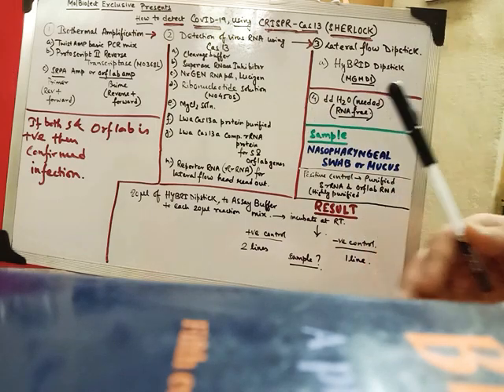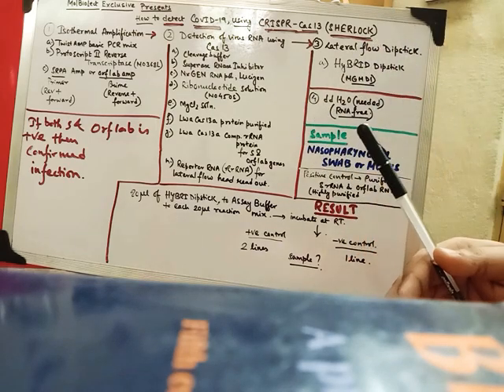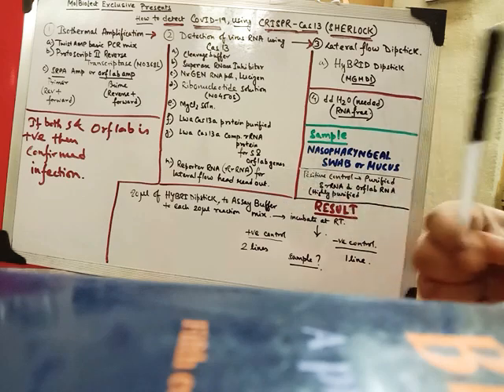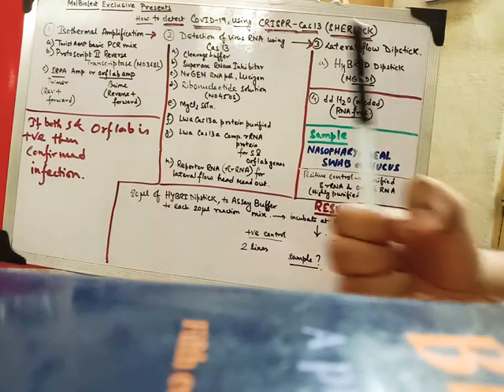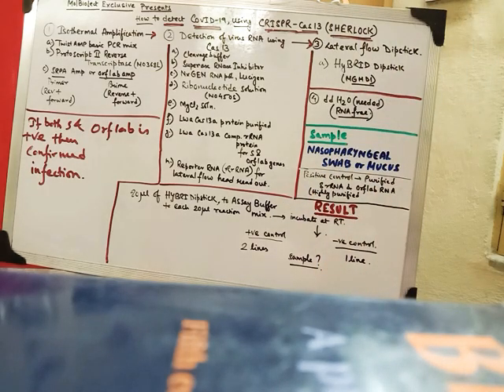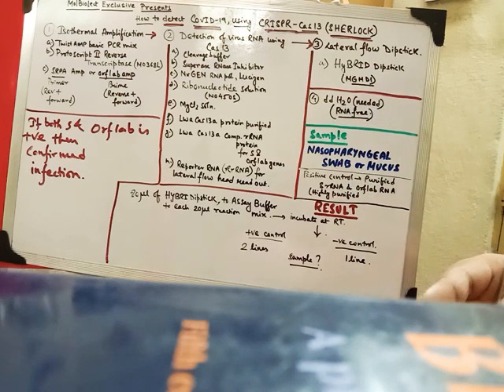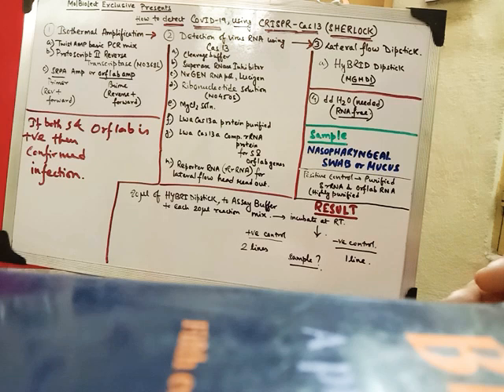Lucigen T7 polymerase. 0.6 microliter. We are adding this polymerase for the essential making of the RNA hybrids. And also we are getting magnesium chloride. It is for stringency purposes. Such that the reaction is stringent.